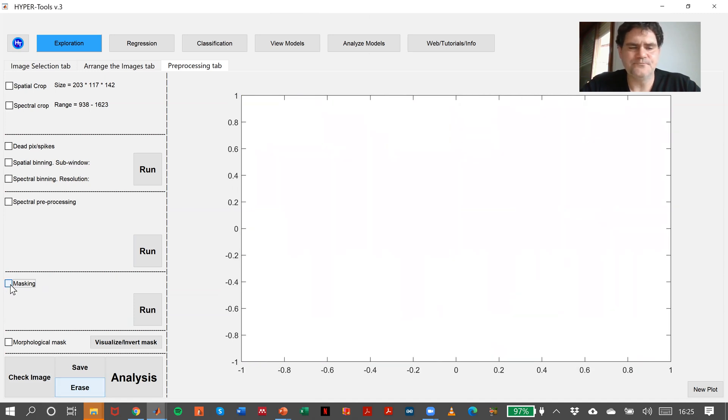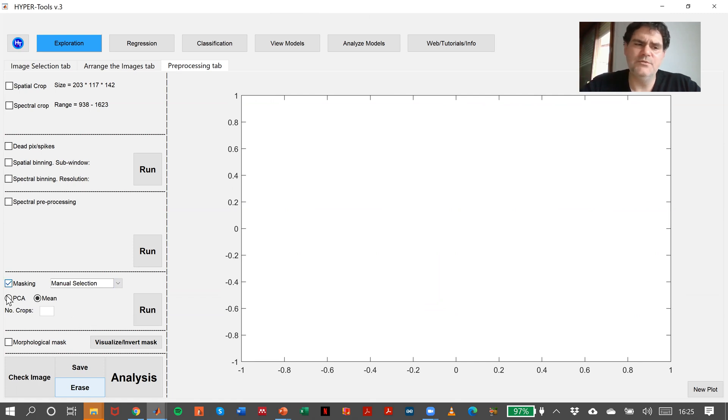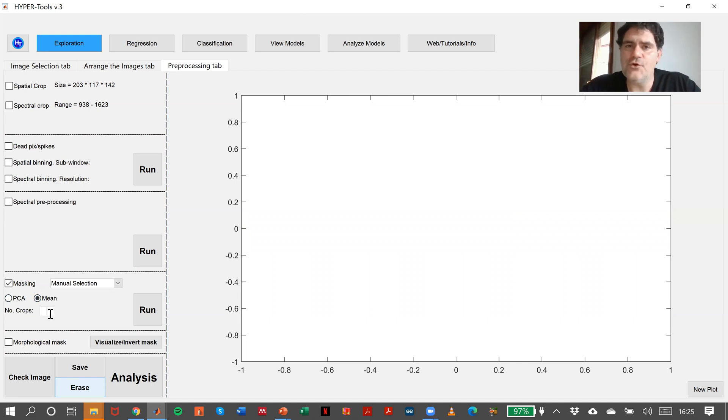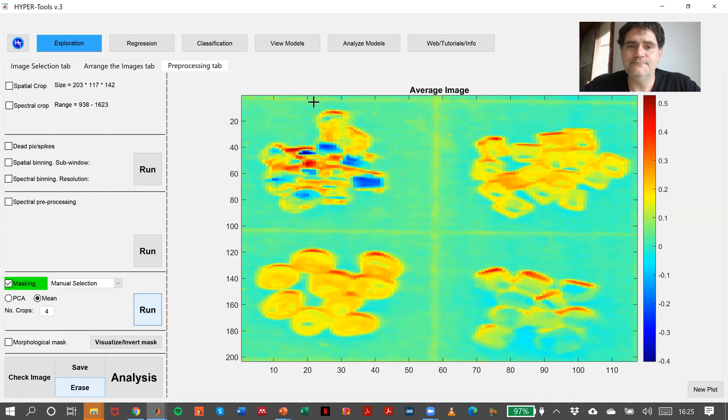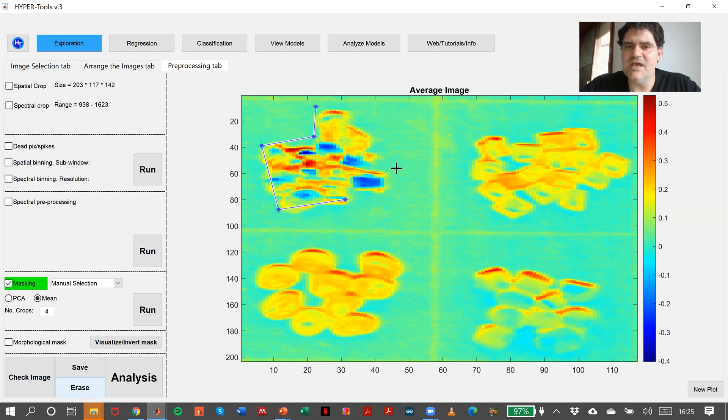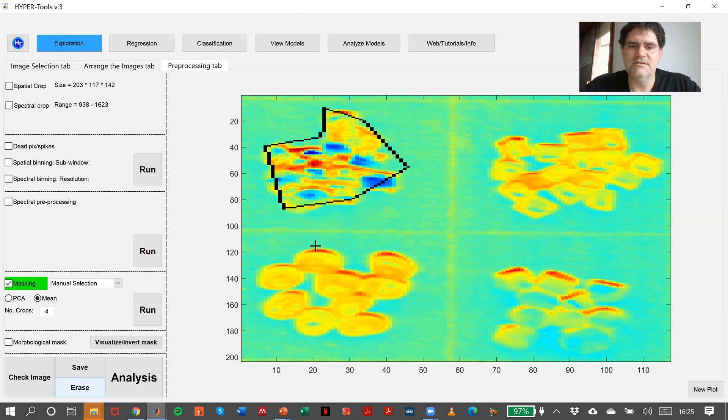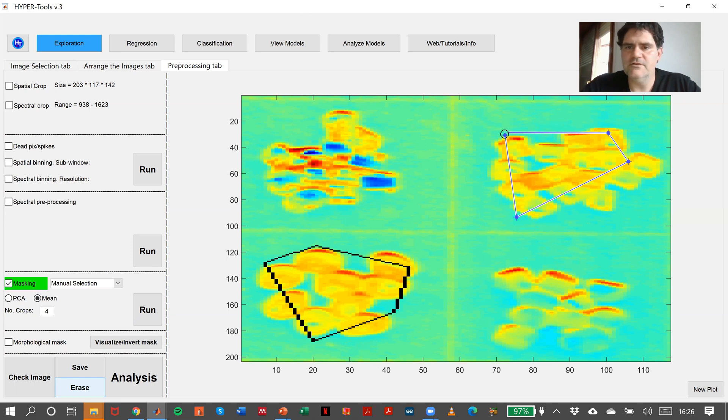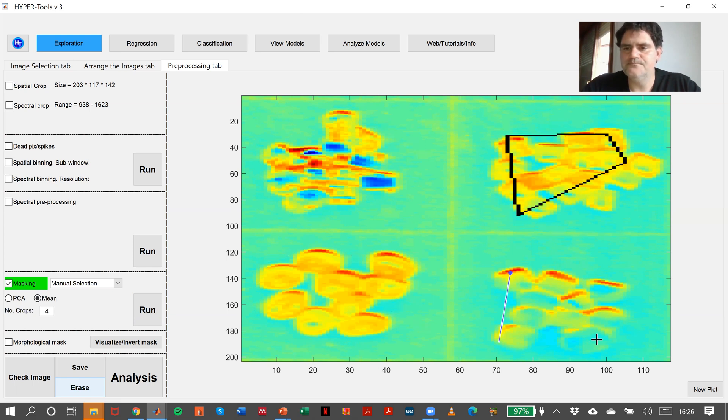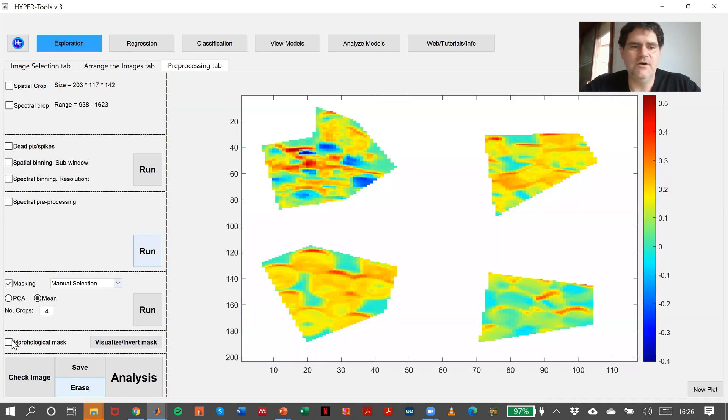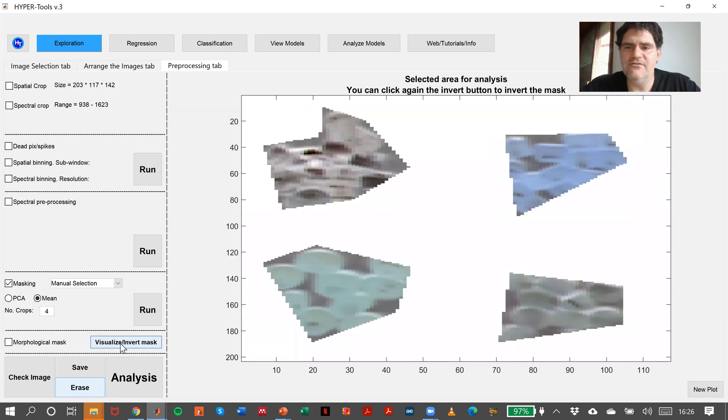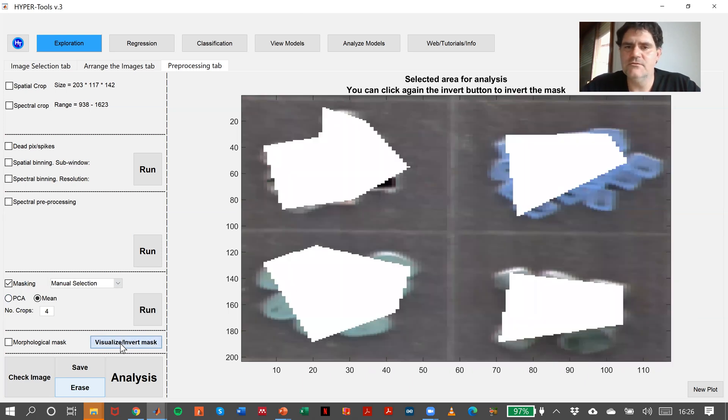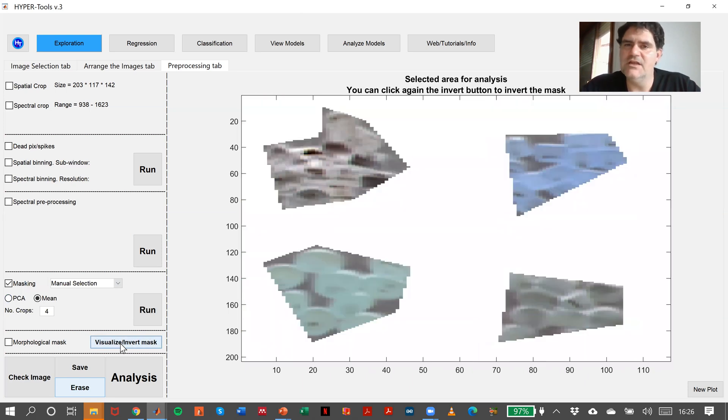And finally, we can also select a manual selection. We have the option of doing a PCA or the average image and say number of crops that I want. In this case, I want four. So manually with the mouse, and it preserves the shape of the cut. This is the first one, this is the second one, this will be the third one, and this will be the fourth one.